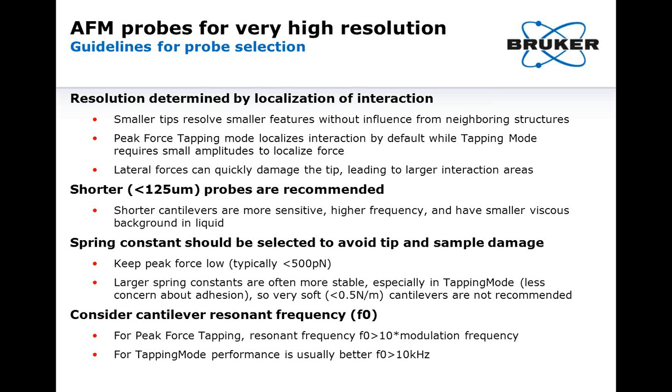And lastly, for considering the resonant frequency, we want to make sure that the resonant frequency of the probes is greater than the modulation frequency by about a factor of 10 for PeakForce tapping. And for tapping mode, we generally want a probe that has a resonant frequency on the order of 10 kilohertz.